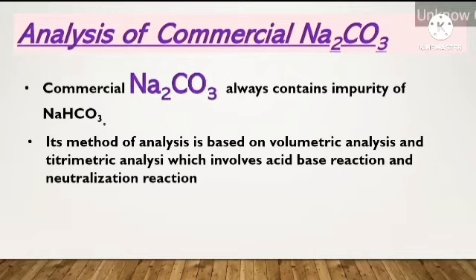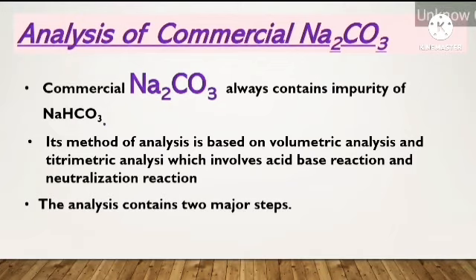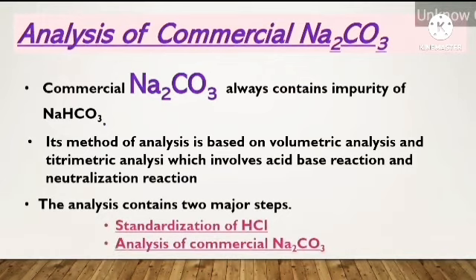This analysis is based on volumetric and titrimetric analysis, which involves acid-base reaction and neutralization reaction. This analysis consists of two major steps. First is standardization of HCl and the other is analysis of commercial sodium carbonate.